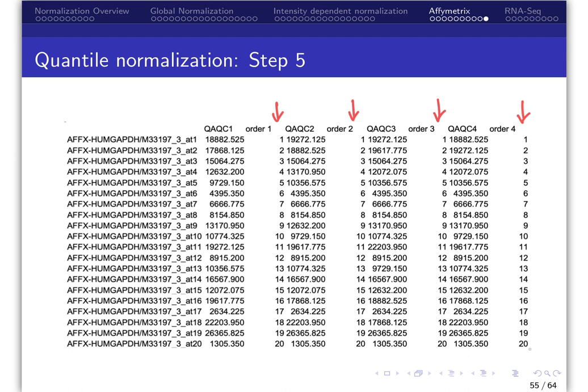In the active learning lab associated with this module, you will practice reading in Affymetrix gene chip data, extract perfect match and mismatch intensity values, and perform cyclic Loess and quantile normalization.